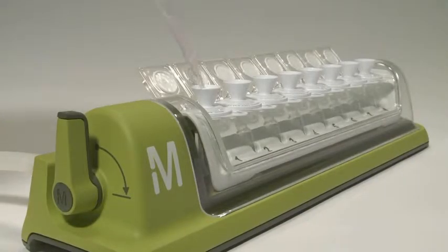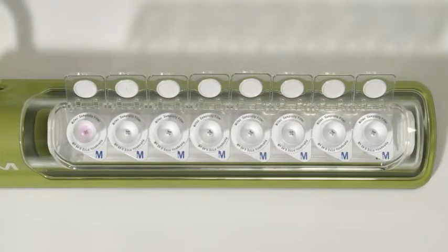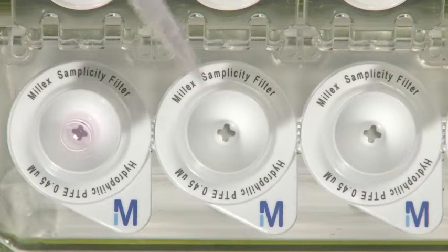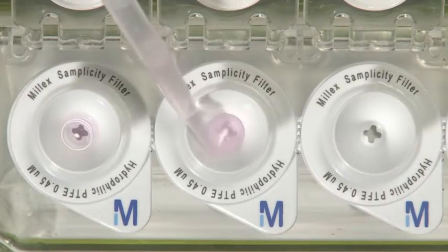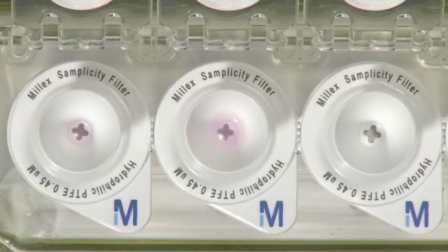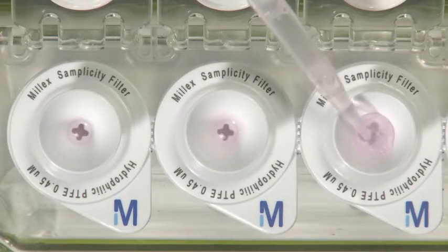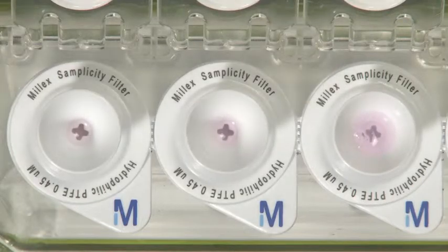Add samples to the conical filter funnels. You can add up to two milliliters of sample, which is the maximum capacity of the HPLC vial. Because the Samplicity system is vacuum-driven, you recover considerably more sample volume than you can with a syringe, and you can filter samples as small as 200 microliters.